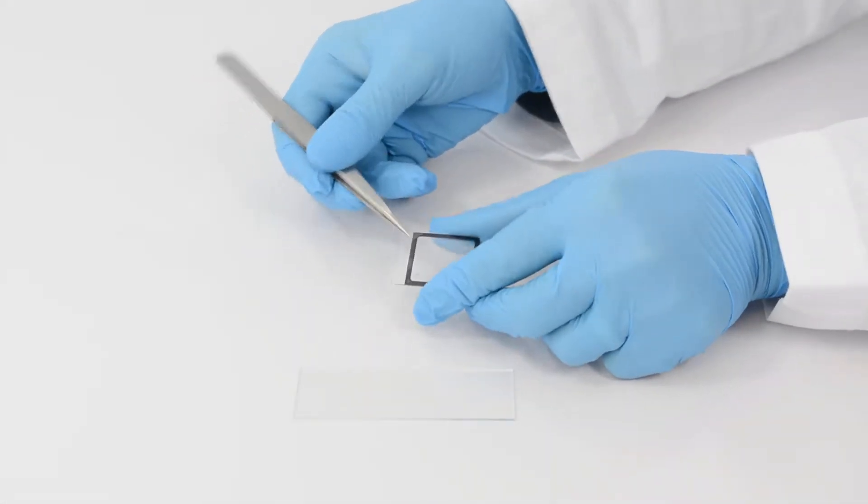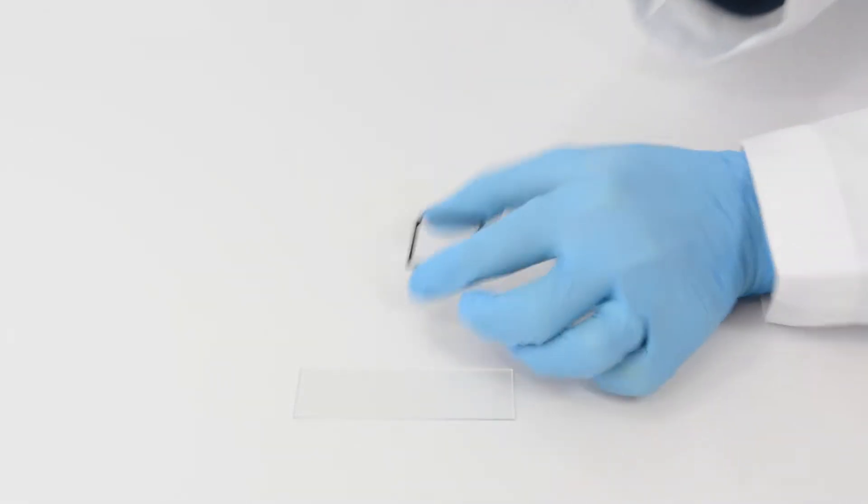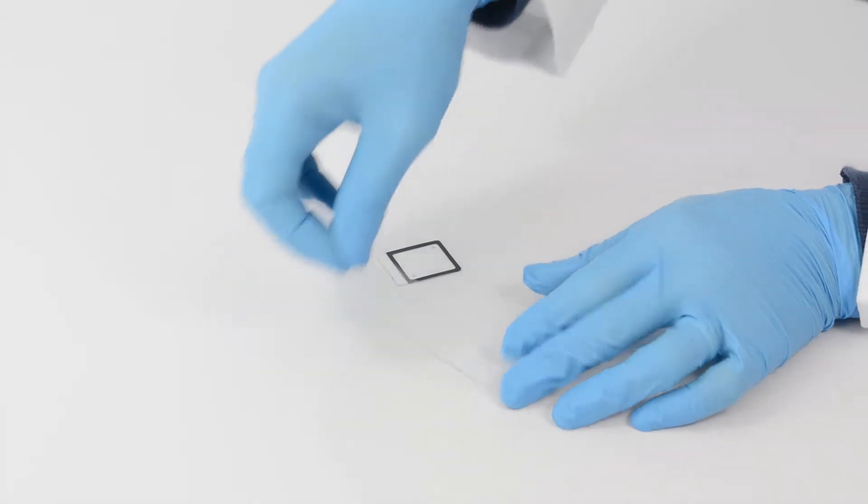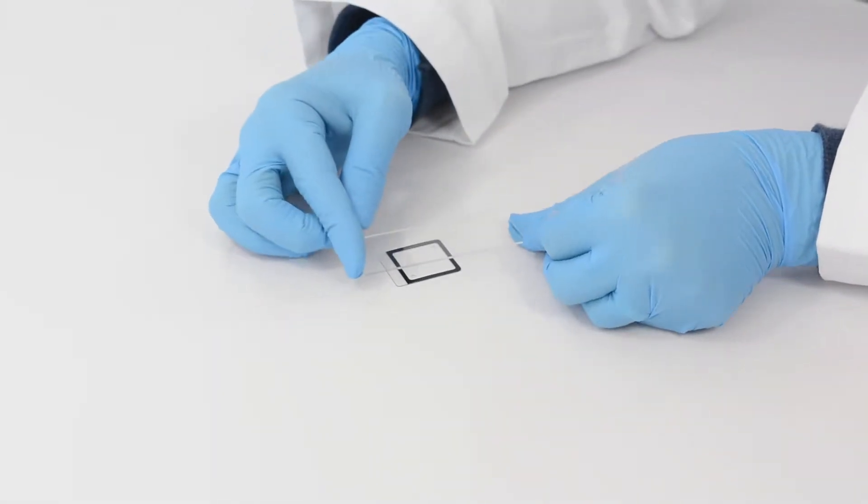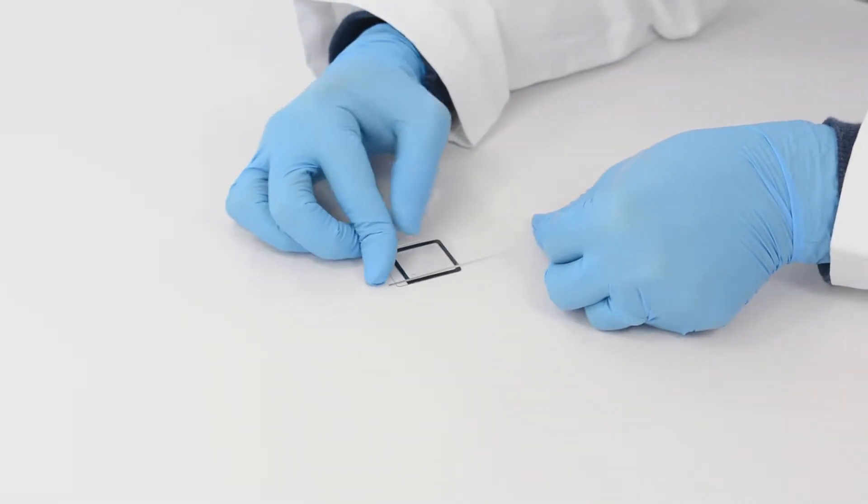Start by removing the liner from the adhesive. With the adhesive side of the chamber facing up, place a slide on top of it and press down.